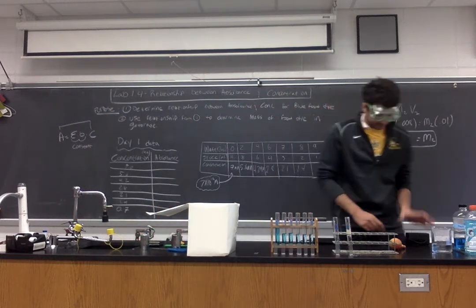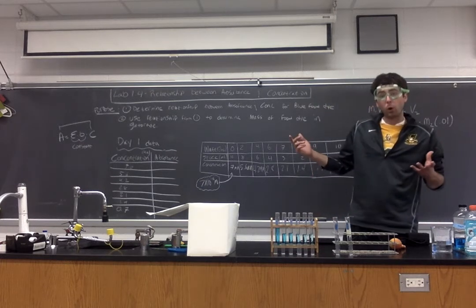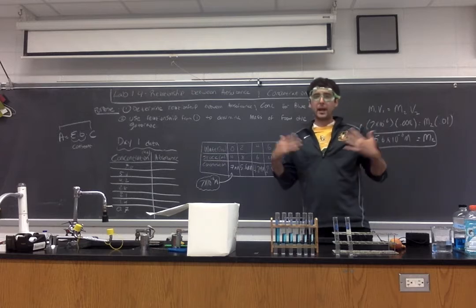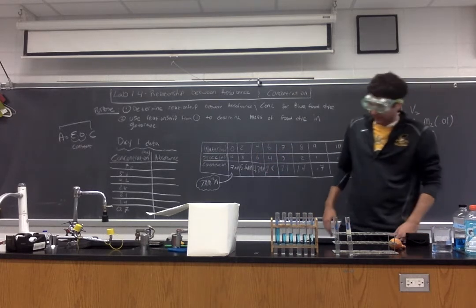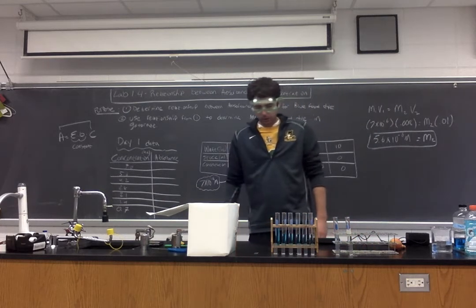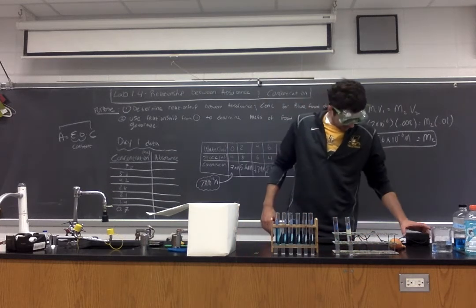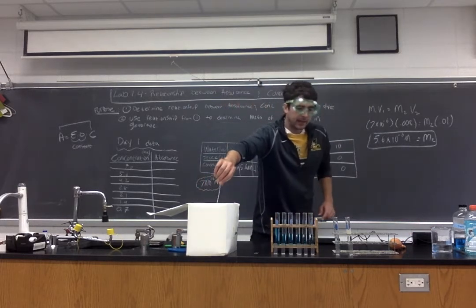saying that a specific point should have an absorbance of 0. Now, right now, the device is actually calibrated, but I want to show you this for steps moving forward, just in case we're back in school and you are actually running this type of experiment yourself. This is a type of experiment that pops up quite a bit this year. So, what am I going to do? To calibrate the device, I am going to read deionized water.